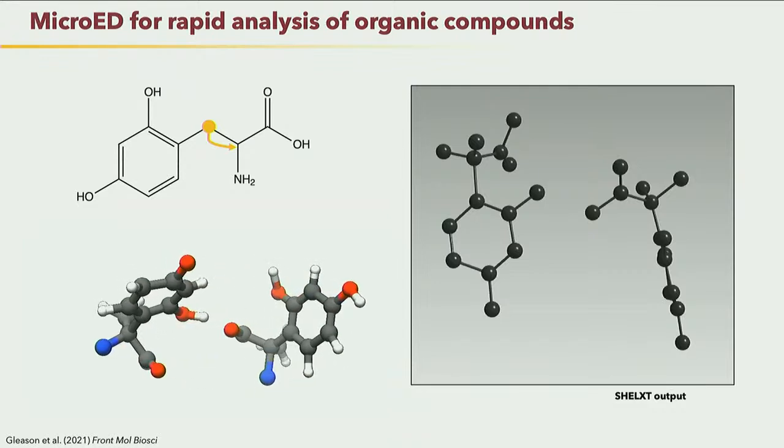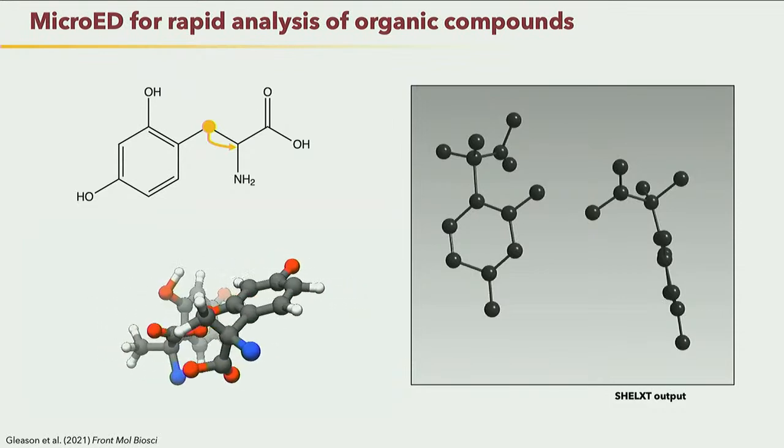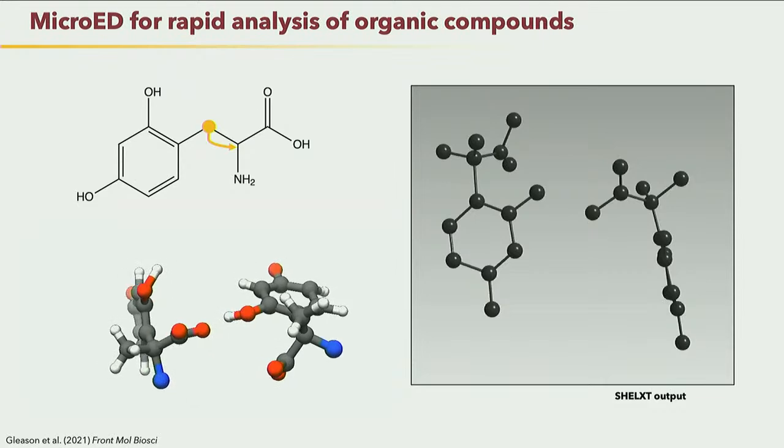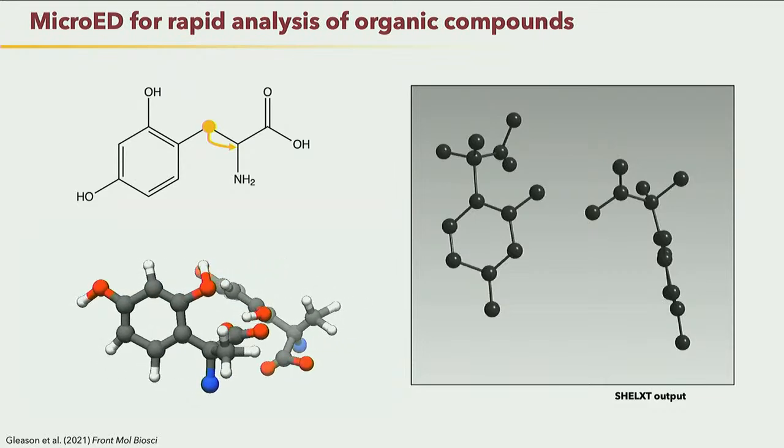And it actually showed them that, yeah, they did make something weird. The NMR people were right. The crystal was actually racemic, meaning it was being made outside of the enzyme as some weird side reaction. And what they were getting was this carbon that's supposed to be here had somehow moved over here. So that was what was giving them this weird NMR signal that they weren't expecting.